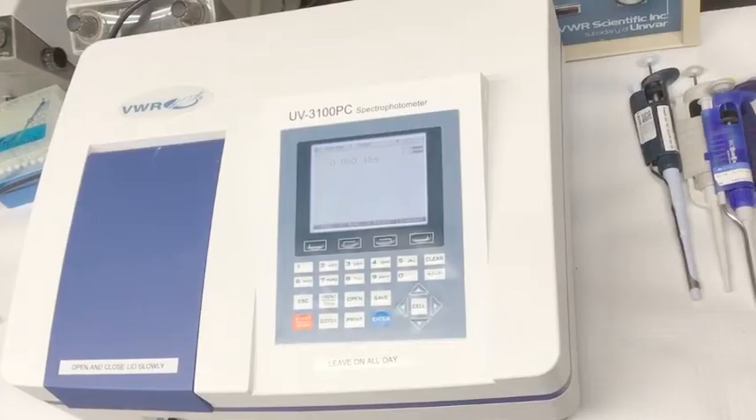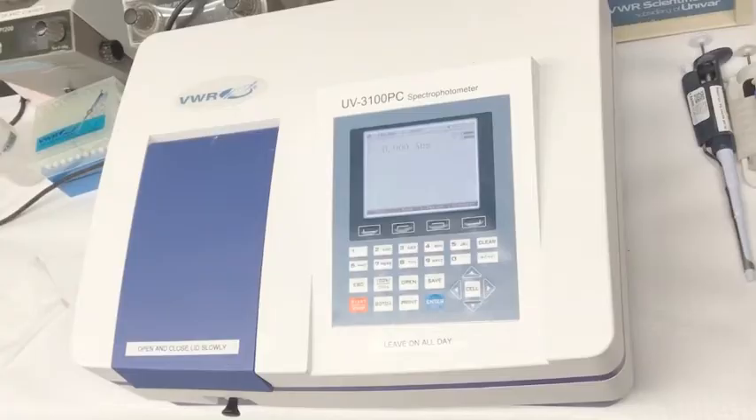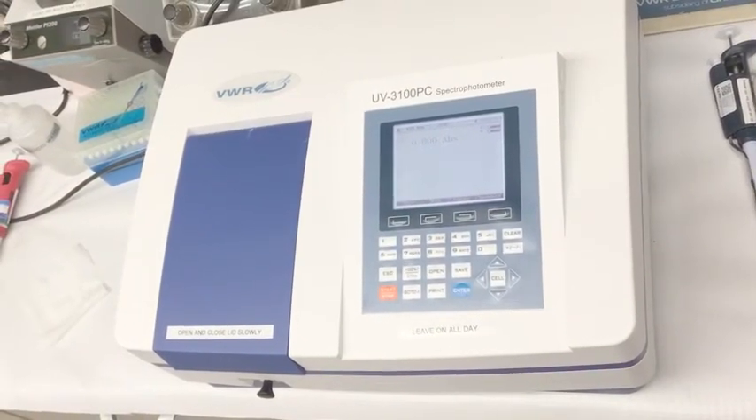At this point, the machine will blank with the water cuvette in position 1. The absorbance should read 0 if you blanked the machine correctly.